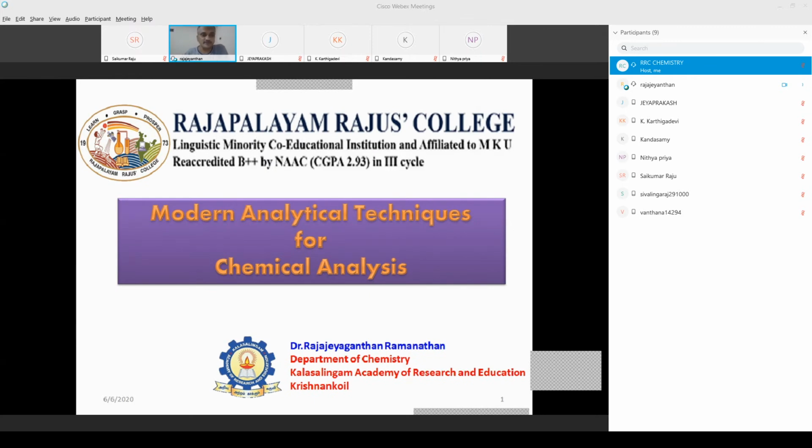Today, the topic of the seminar is modern analytical techniques for chemical analysis. We all came across a lot of spectroscopic techniques which use a wide spectrum of electromagnetic radiation. For example, we use ultraviolet radiation in UV spectroscopy, infrared radiation in Fourier transform infrared spectroscopy, radio waves in nuclear magnetic resonance spectroscopy, and X-rays in X-ray diffraction and X-ray photoelectron spectroscopy. But here we are going to learn about a new spectroscopy based on synchrotron.